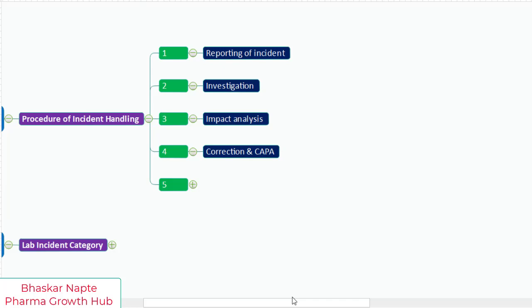Now that action is called the preventive action, that you are not only going to stop the existing non-conformity, but you are also going to stop the possible non-conformities which can result in no peak in the entire chromatographic run. You are actually talking about the preventive action. So correction and CAPA are very important for any incidences. Now once you have identified CAPA, probably CAPA implementation is also done.